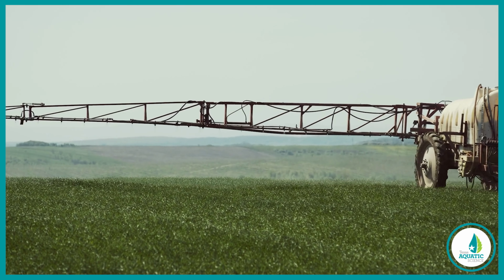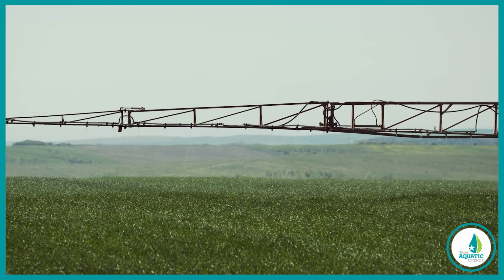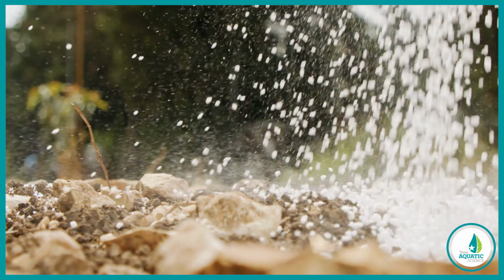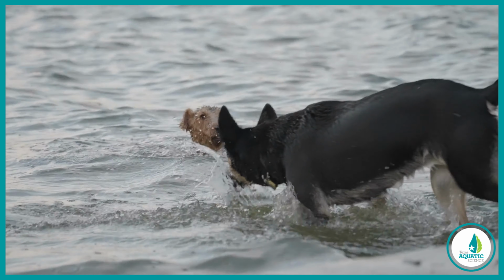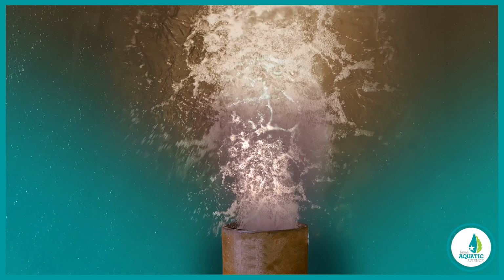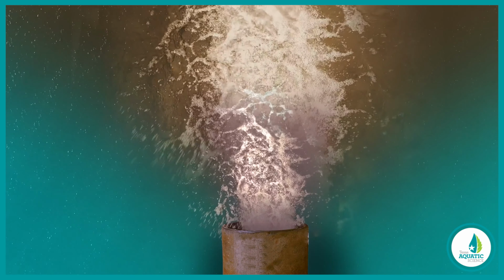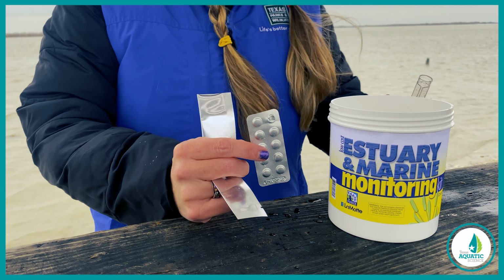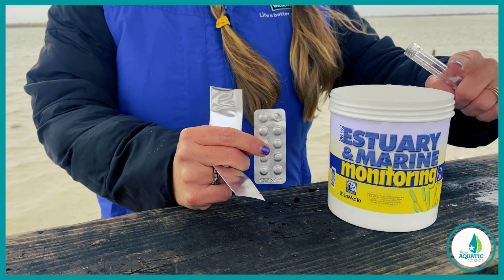Excess nitrates found in Texas waterways are the result of runoff from fertilizers applied around our homes and agricultural fields, animal waste, including that of our pets, improper septic and sewage management, and industrial discharge. Now let's take a look at how to use your collected water sample to test for nitrates.